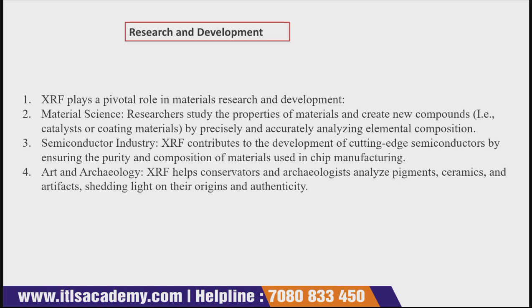Now moving to the end of the lecture, but before ending, let us discuss some important questions. For the important questions, the methodology part is very important. In examinations or interviews they can ask you about the principal difference between the two methodologies, that is energy dispersive and wavelength dispersive X-ray fluorescence spectroscopy. So you must know that. For the instrumentation part, they can ask you about the advantages and disadvantages. But yes, the most important ones are the methodology and the application.